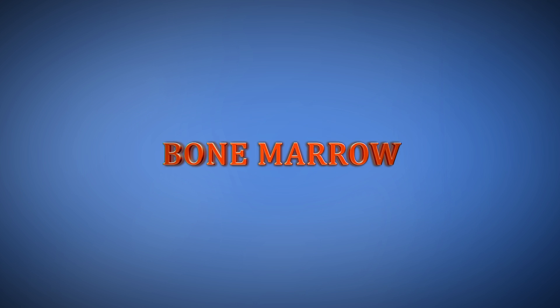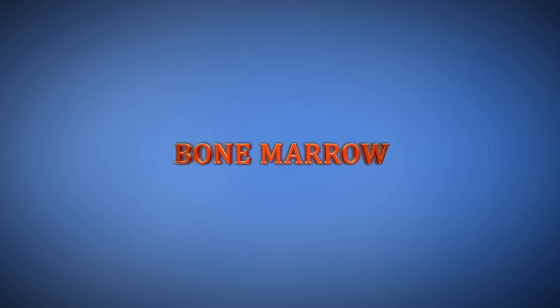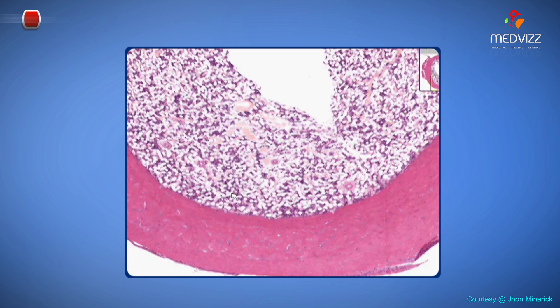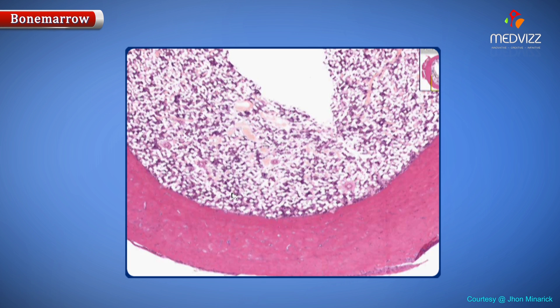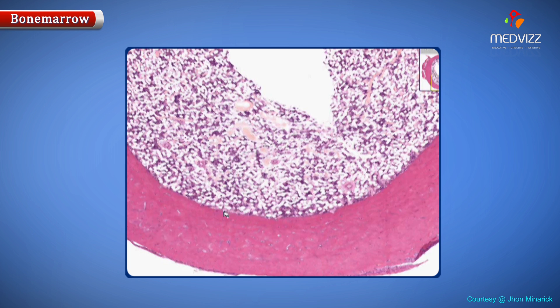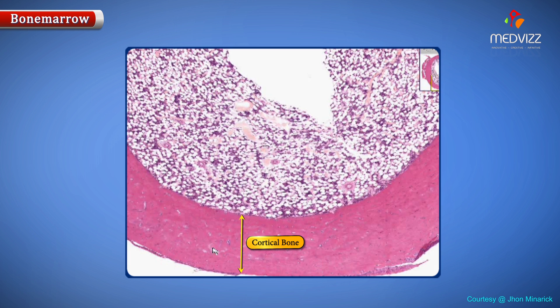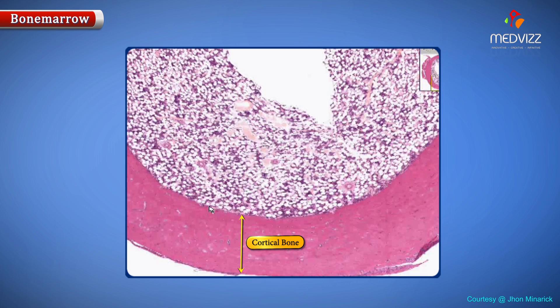Bone marrow. Here we have a specialized type of connective tissue known as bone. Bone can be very, very dense, or what they call cortical bone, which you see here as this pink band in the lower part of the field. Or you can have a looser type of bone, which goes by a wide variety of names, which we don't see here, but we'll get to later.